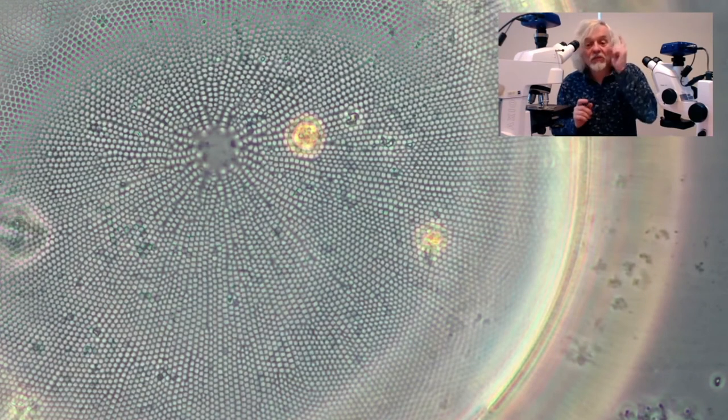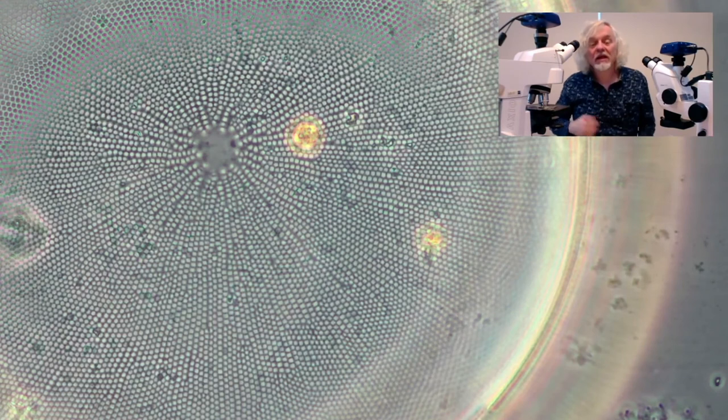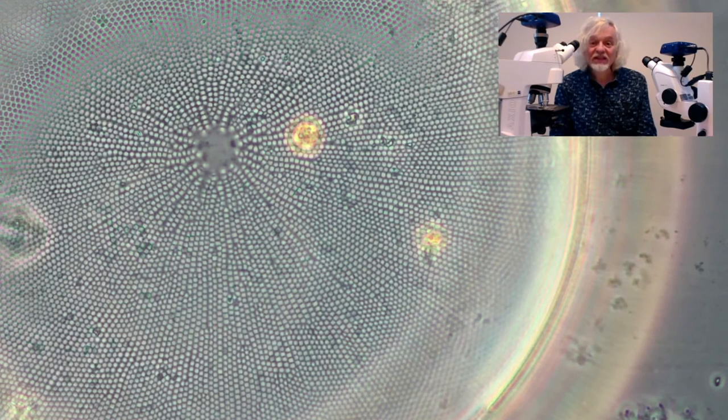Look at this under a scanning electron microscope, which I have done. There's the link. You can see even more detail and that's it. That is Coscinodiscus, a diatom and type of plankton.